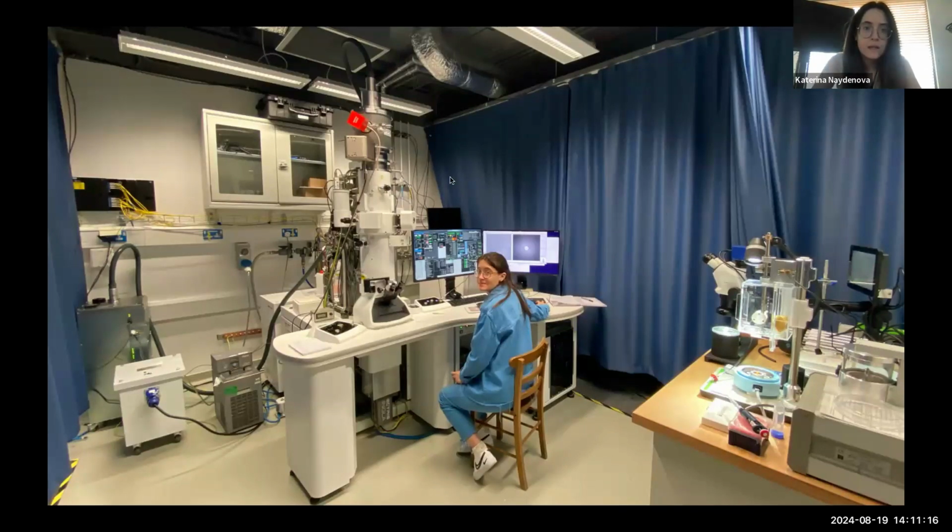collaborators. So here you can see the gray piece on top is the field emission gun made by York Probe Sources. The single detector is at the bottom, and everything is built around this fairly simple JEOL 1400 microscope.